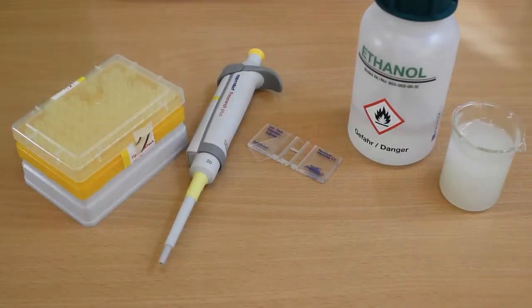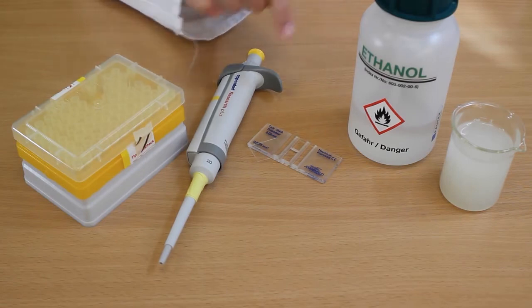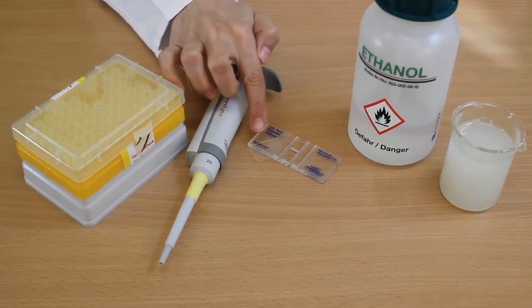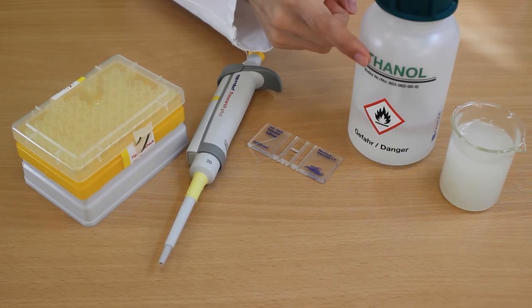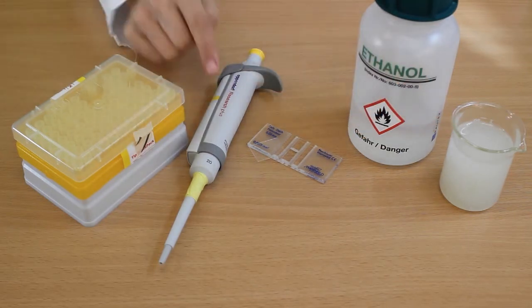Hi, today we're going to show you how to use a hemocytometer to count cells and share some tricks with you so you can do it right from the start. For the exercise you will need a hemocytometer, its coverslip, ethanol, your sample and a pipette with tips.